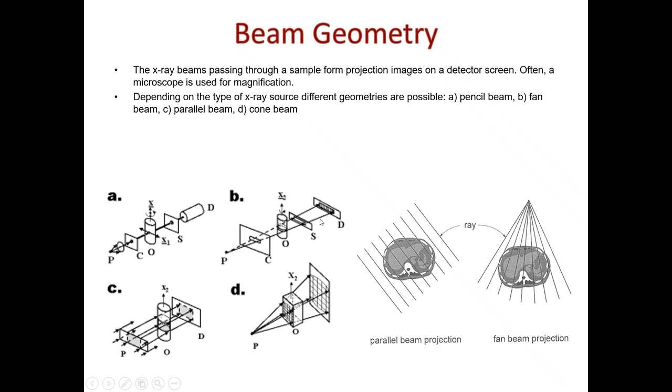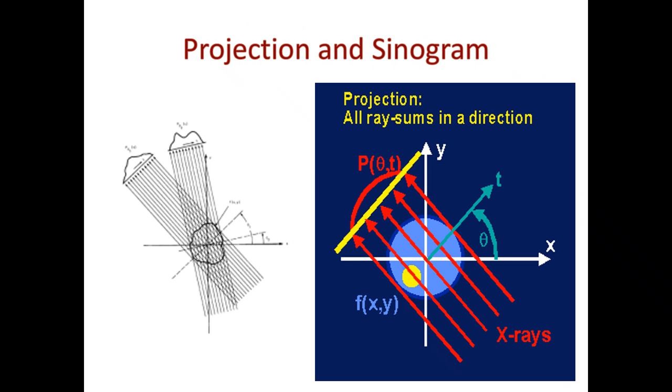And what also matters is how you get magnification and better resolution. It basically depends on placing the object closer. What you have to play with is this distance here and the relative distance of the object to the source versus the detector. Just like you do when you're shooting with a regular camera, right? There's the object versus the light, with the understanding that the light is sunlight that comes from somewhere. So that's essentially the geometrical aspects that are important in what type of magnification you can get. Or can you actually place something in between those objects to magnify?